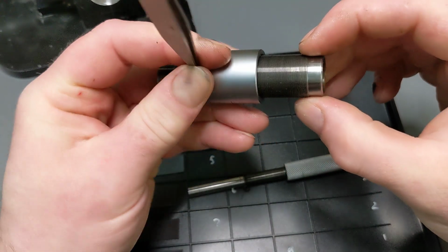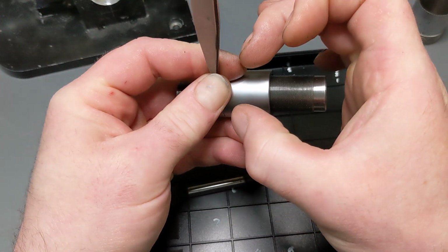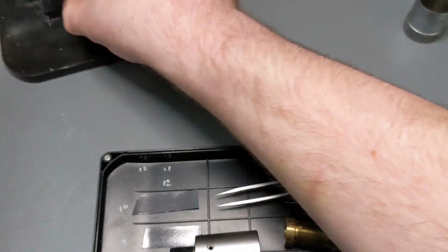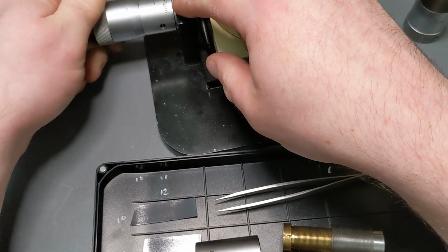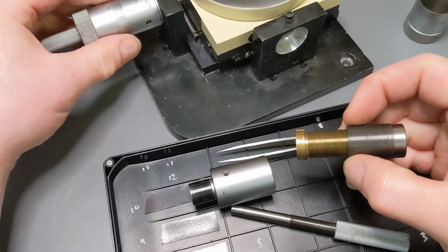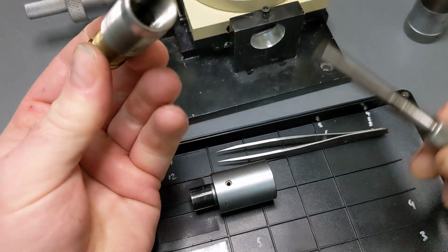now you're not going to be able to see anything, but as I turn this, the difference between the outer pitch thread and the inner pitch thread on this is sliding that brass plug back and forward by just the tiniest amount. So on this guy, you can see it's got all this depth. This is halfway in. It comes all the way out and goes all the way into that notch. That entire range, and that's, like 50 turns or something, only moves it up and down this slot just a little bit.